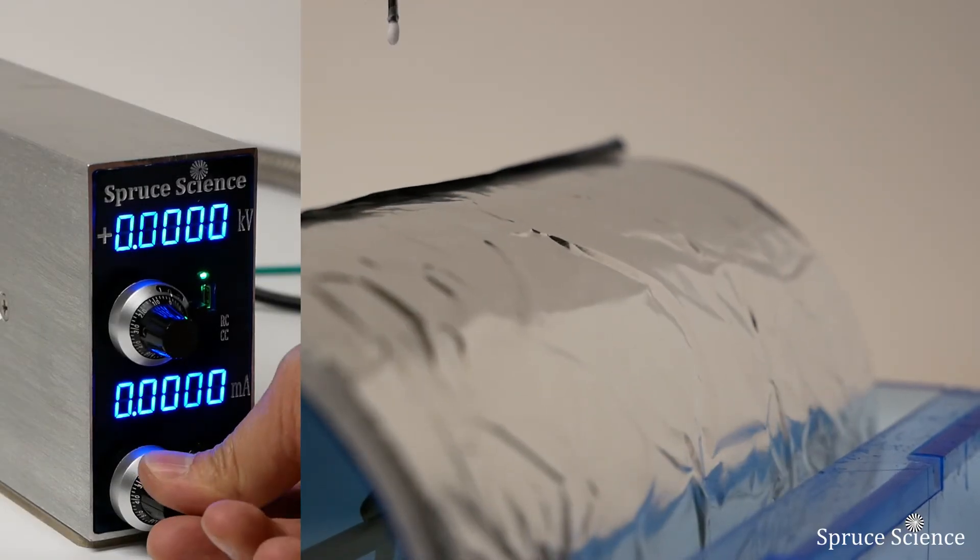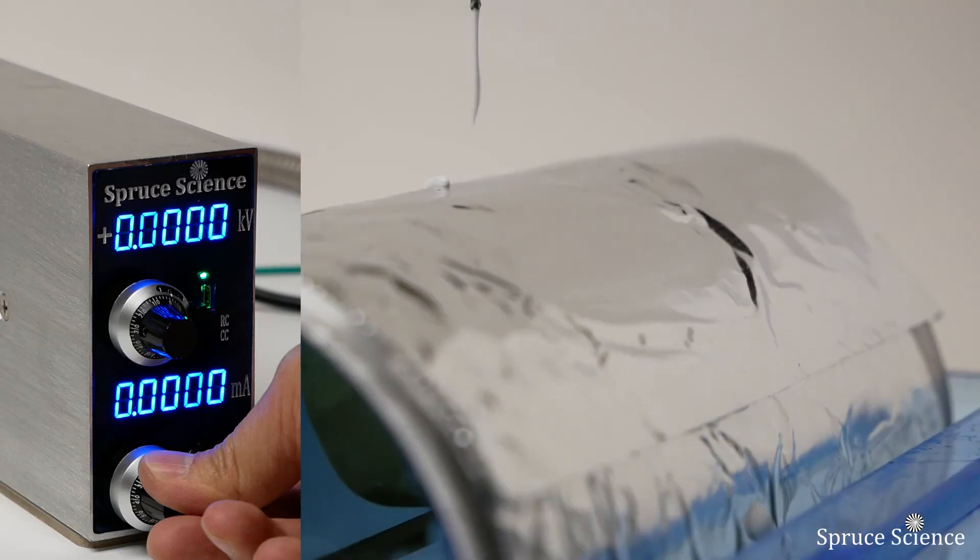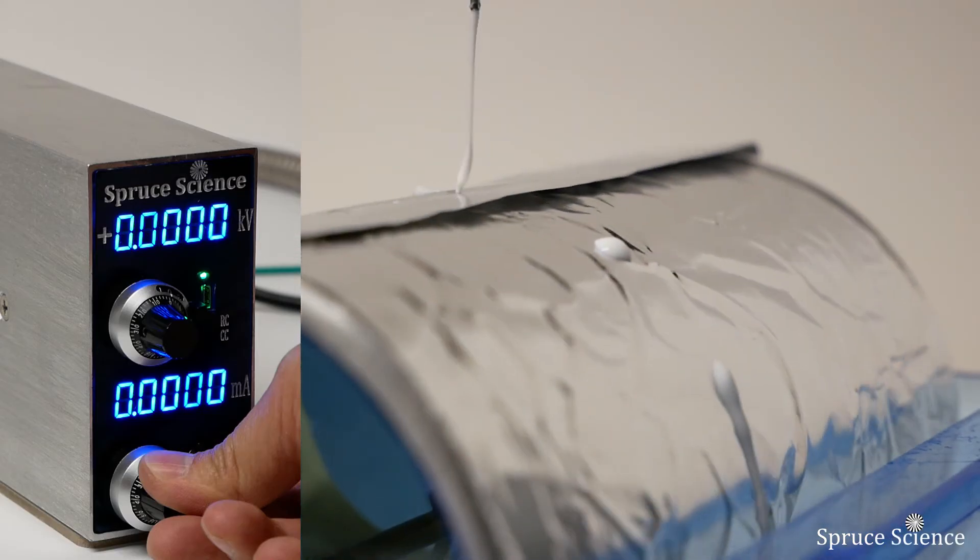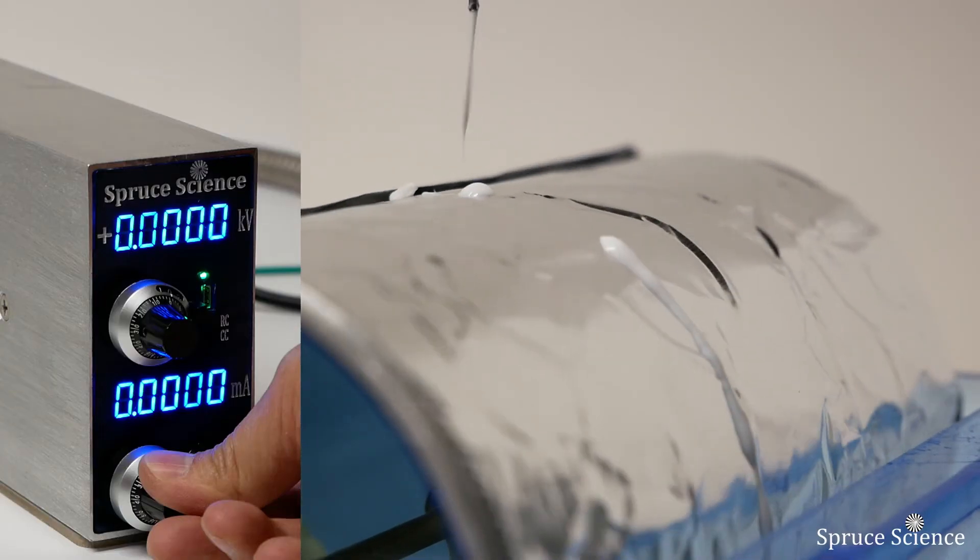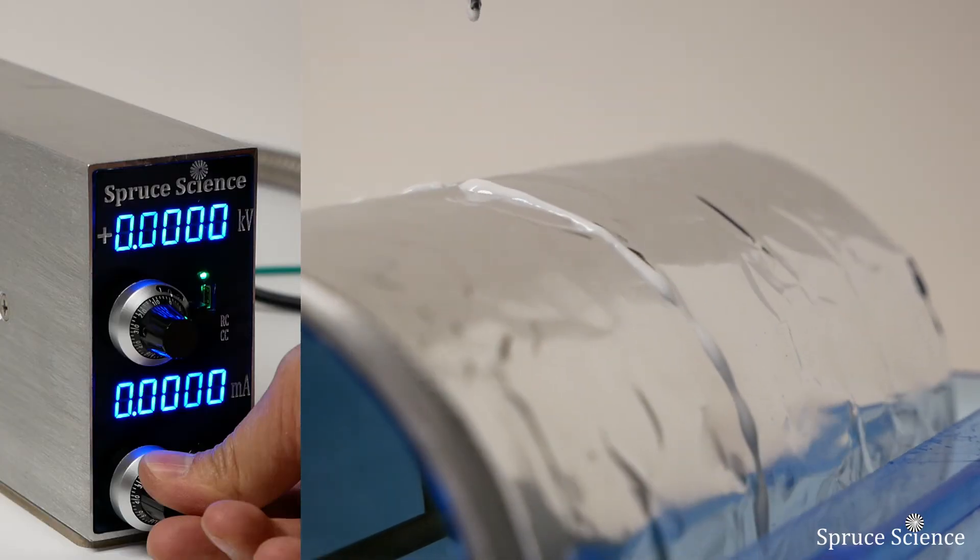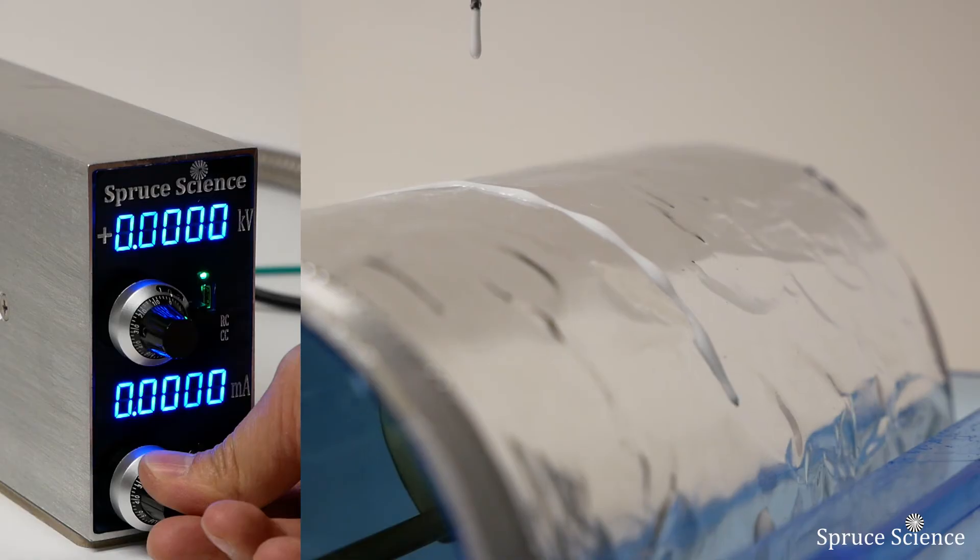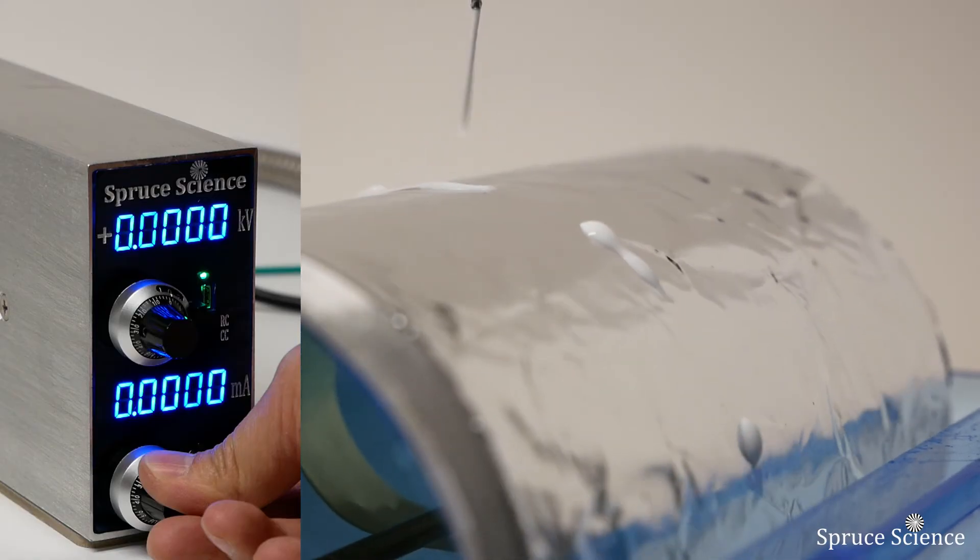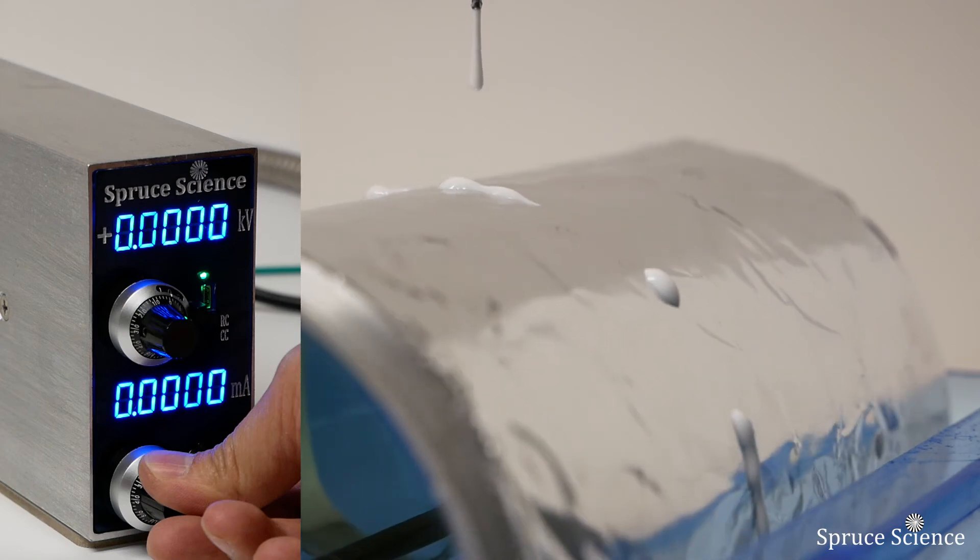On the high voltage power supply, adjust the current setting to the smallest output value that will work for your setup. In this particular demonstration, electrospinning did not require any current output, so the current limit was kept below 0.1 milliamp. This will limit the current output in case there is a short.